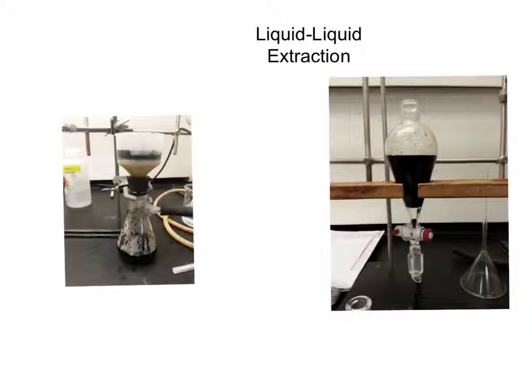When solid-liquid extraction was over, we moved on to liquid extraction. This two-step procedure allowed us to have a more pure sample at the end of our experiment. We took the solution from the solid-liquid extraction.